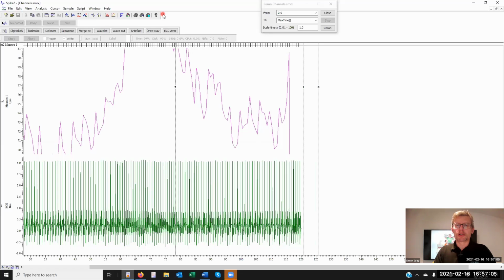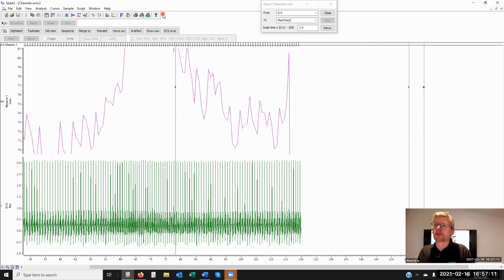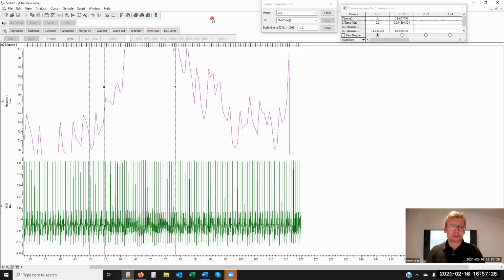Now, no matter which key combination I press, that is Control Shift and the left or right arrow, the expression means that we're always marching into positive time. Right. Now, to be able to log the data, if we had cursor regions here, cursor moves, we have a new measurement here. Cursor moves, we have a new measurement produced.